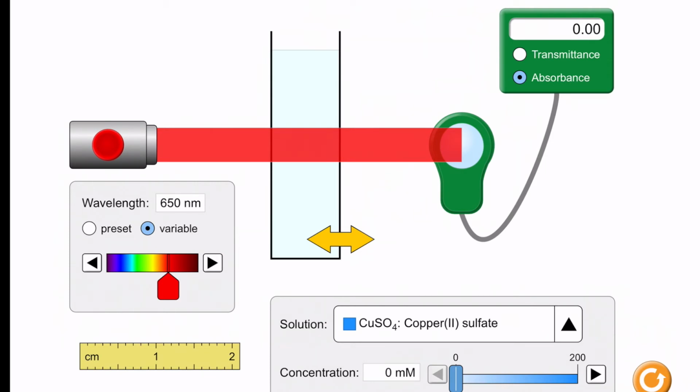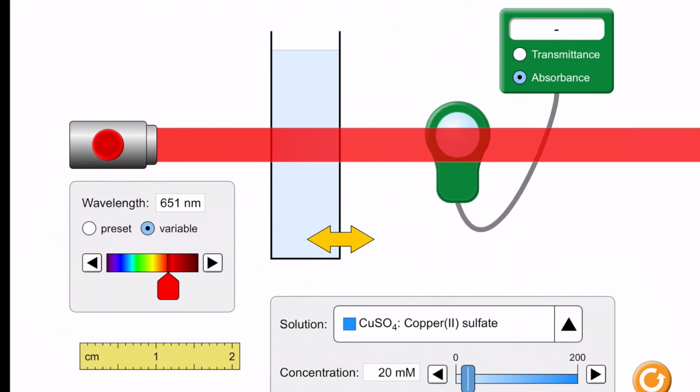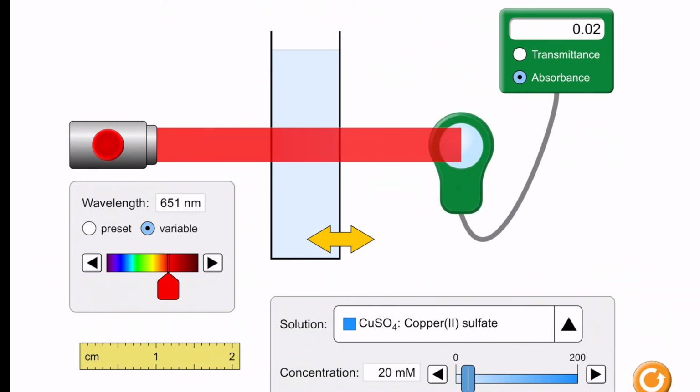I can change the wavelength here. So we have chosen to do red. So I'll put it on 651, which is close to what we would do. And I'm going to use copper sulfate as our solution because that's similar to our copper chloride that we're using in the lab, and it's a blue color. So you can see here that the concentration is 0 down at the bottom, which means that all of the red light should be able to pass through. As I increase the concentration, you can see up in the right-hand corner where the absorbance is being taken by this piece of glass, that the absorbance is increasing.